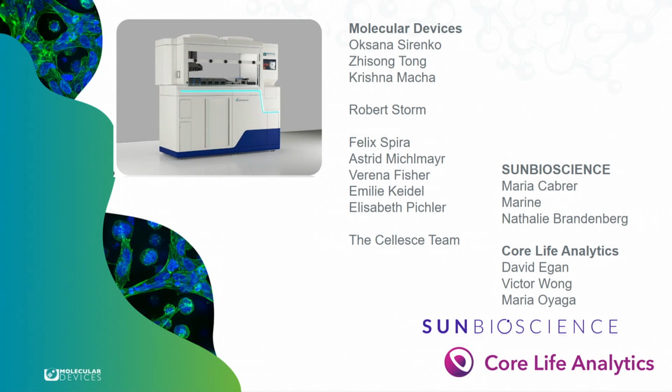So are you talking about the labware or, I mean, what kind of applications are you thinking of? Because I think with this setup, a lot of our endpoint assays are image-based, right? If you want to do more of a biochemical or even a plate reader-based luminescence assay, it can be done too. What you do is hook up the plate reader into the automation system, use the liquid handler or plate washer to do the processing, and then feed the plate to the plate reader.